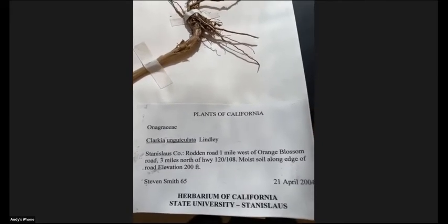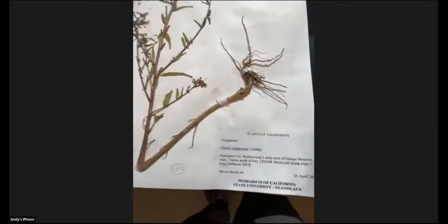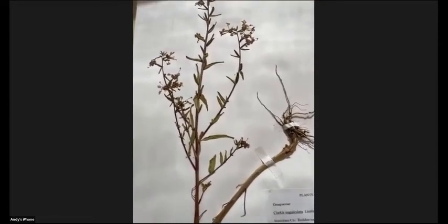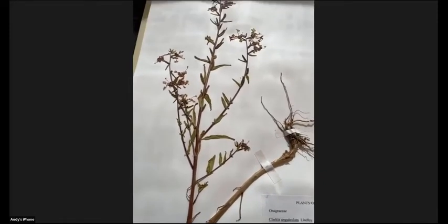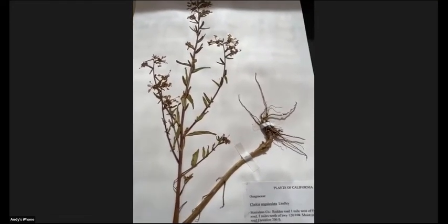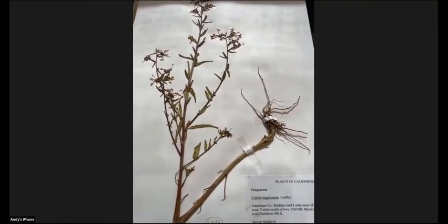Right, so can we figure out how many years ago that was? 18. That's right. So plant specimens, once you press them and dry them out and mount them on this piece of paper, they can last for quite a long time. This one's 18 years old, but we have some specimens in our herbarium that go back to the 1960s and even earlier. And people have continued to work with specimens that are hundreds of years old, in fact. That's one of the cool things about these specimens, is that they're designed to last.